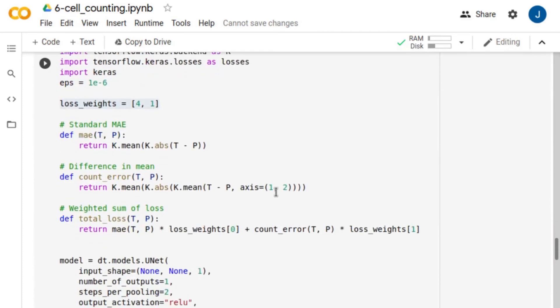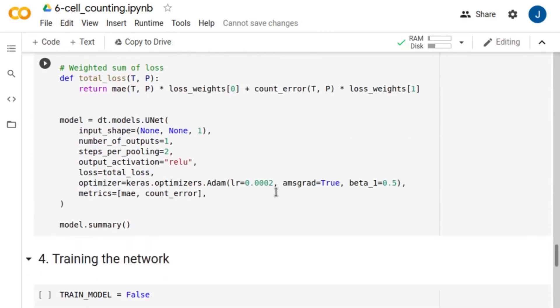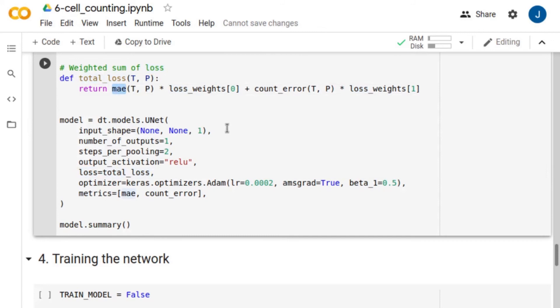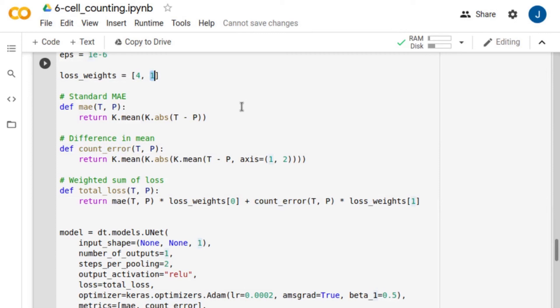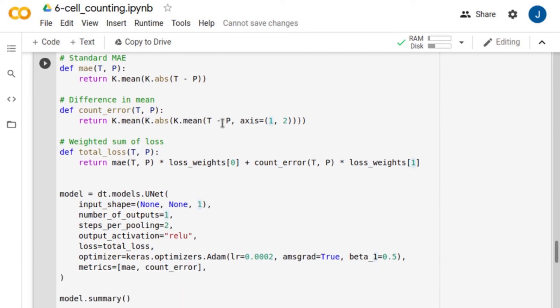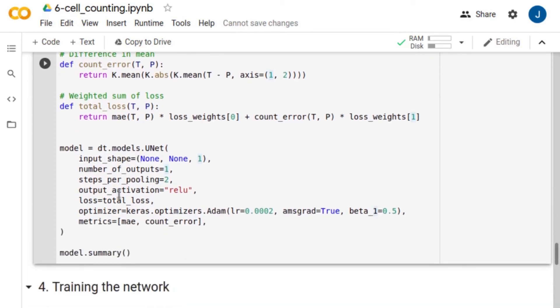In this example, we train a U-Net model. We compile the network using the mean absolute error loss function. Also, the network minimizes the difference in mean between the ground truths and the predictions. We give more weight to the mean absolute error loss. We use Adam as optimizer.